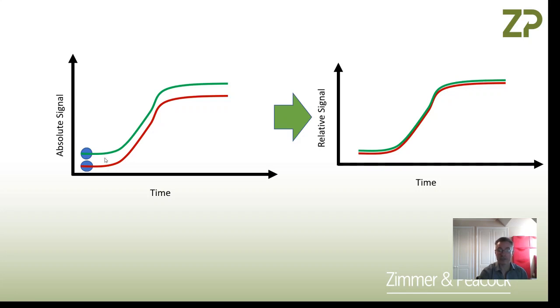The 2 sensors give different absolute signals, but in this example they're modeling the same process, so they should definitely not be different, but they are different. It's because the sensors themselves are different, or they're in slightly different environments within the food.